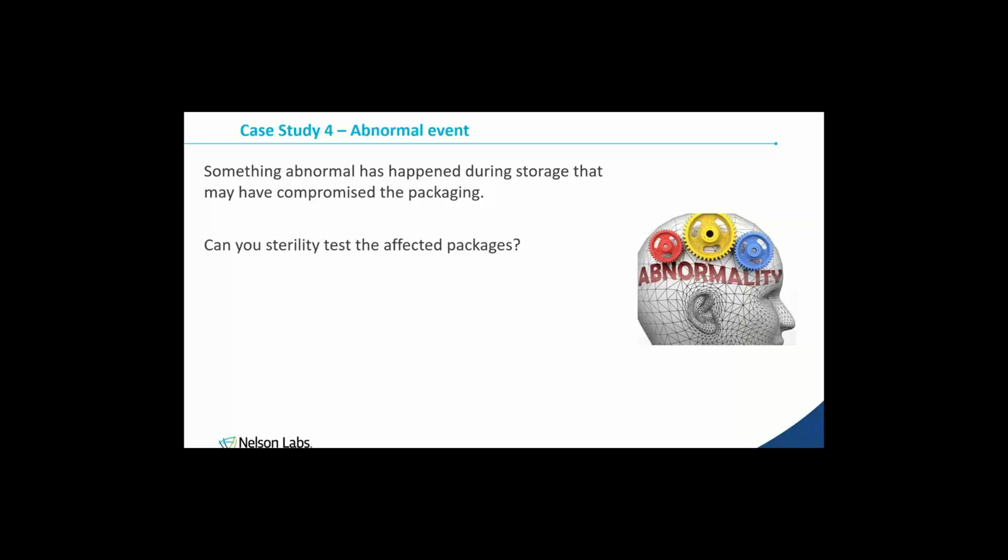Well, first of all, I'm relying on those microorganisms. If my packaging is intact, just like we discussed with the other slide, I shouldn't lose sterility. So packaging testing is probably going to be more applicable than sterility testing. But even if I have a sterility test pass and my products got wet, that doesn't mean my product's okay. Tyvek is essentially a really good filter.